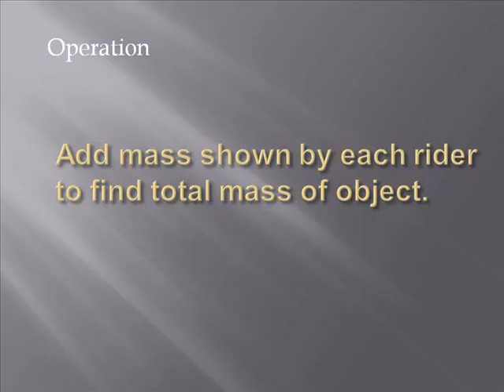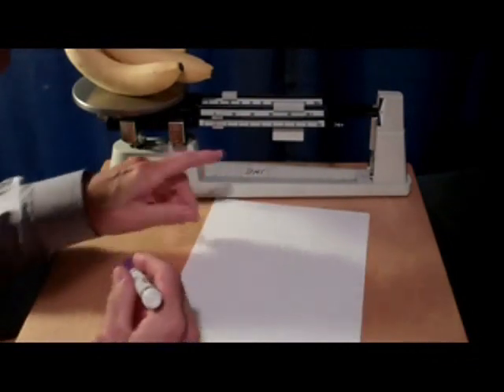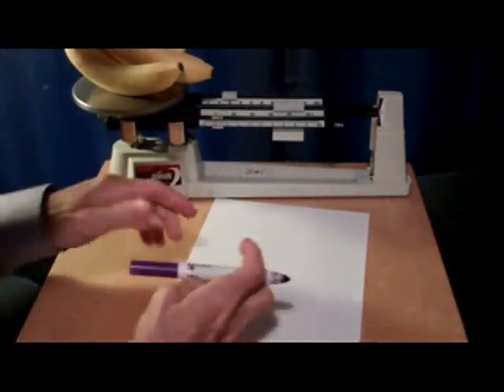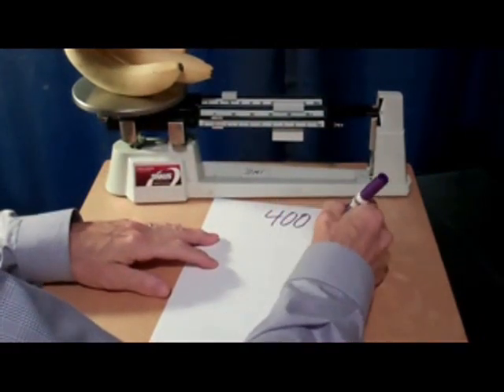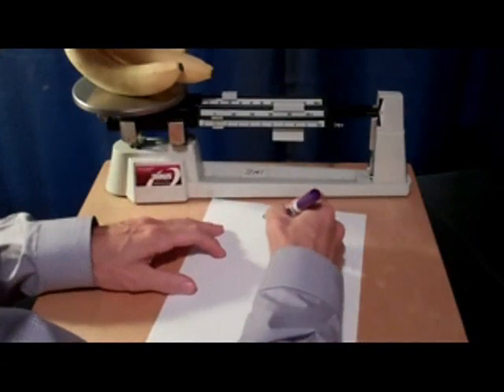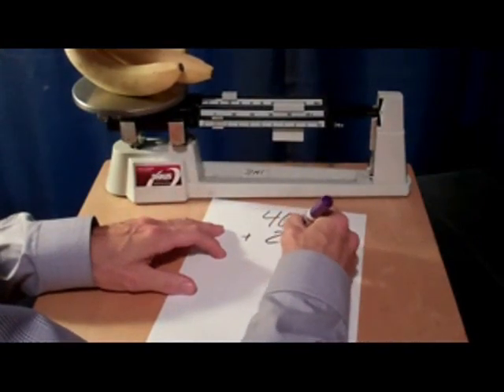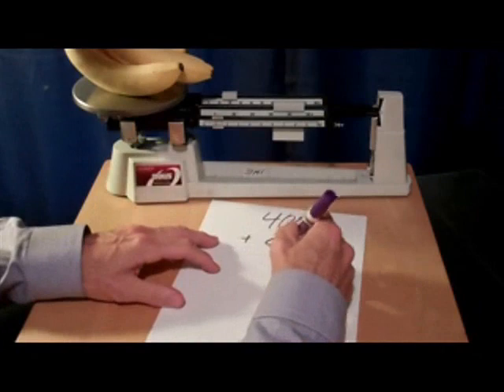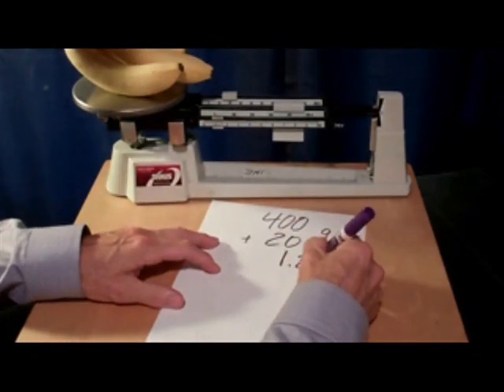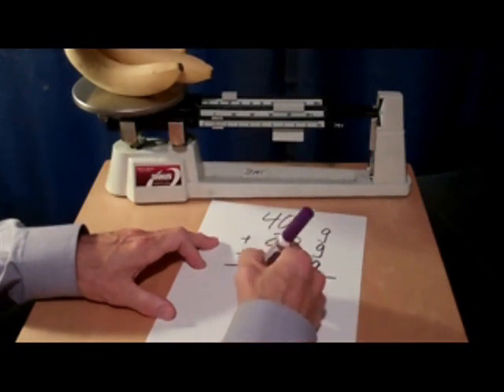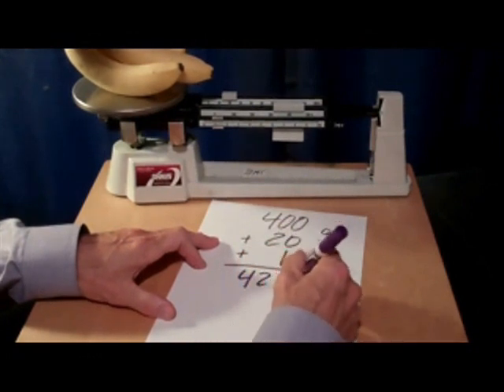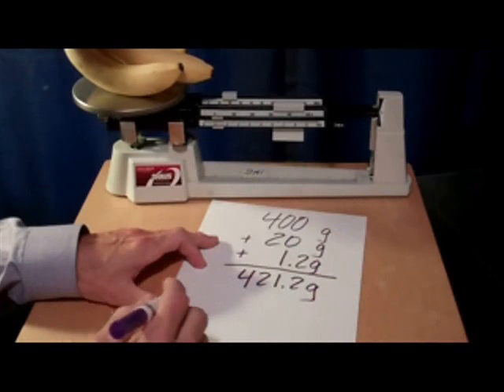The final step is to add the mass shown by each of the riders to find a total mass of the object. The final step involves reading each of the riders and summing them up. 400 grams for the big rider plus 20 grams for the medium rider plus 1.2 grams for the small rider makes a total of 421.2 grams of bananas.